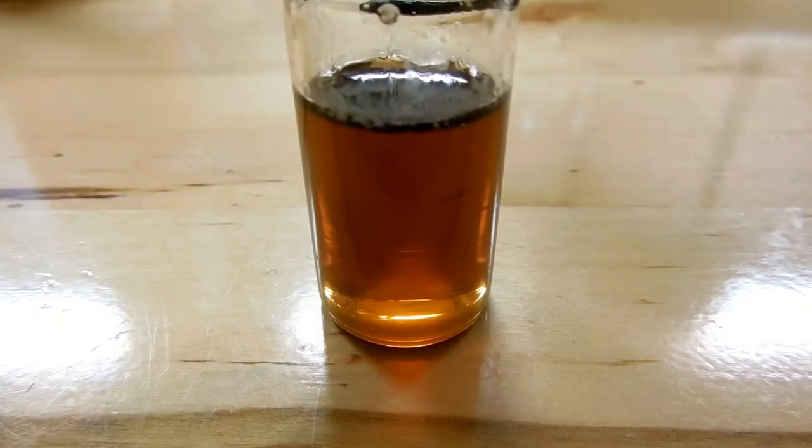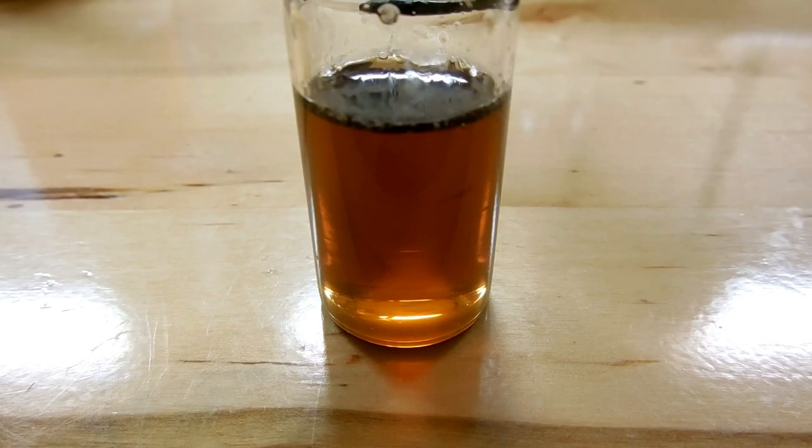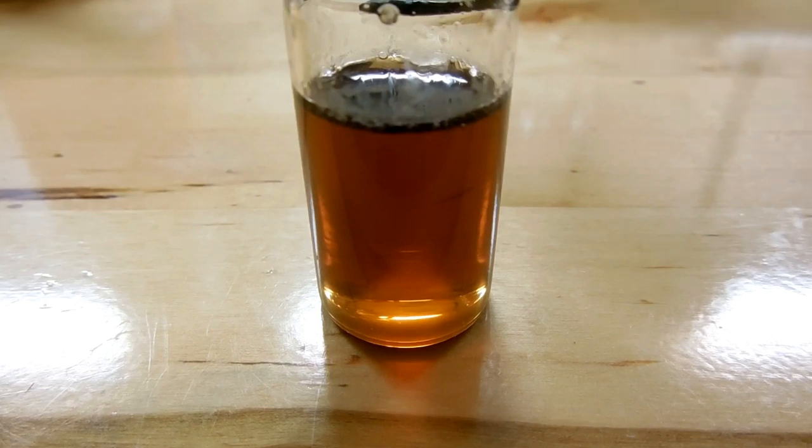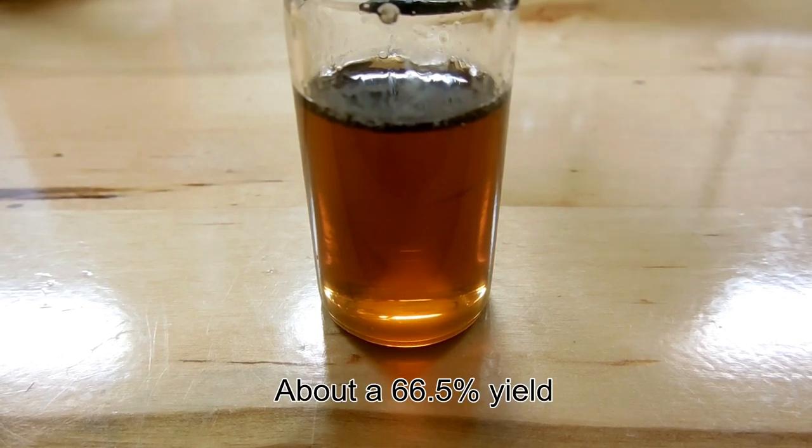So here's my product: 6.3 milliliters of methyl salicylate or oil of wintergreen. That's 7.3 grams. Theoretically the maximum we could have achieved is 9.3 milliliters or about 11 grams, but of course everything's going to be a little bit less than that in practice.